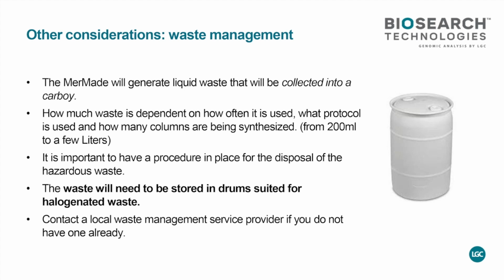So you want to make sure that you have that account set up before you start generating the waste from the instrumentation, because if you have a full bucket of waste, what do you do with it? They usually bring you disposable drums and you dump your waste into them, and then Safe Harbor comes in and takes them away to disintegrate.